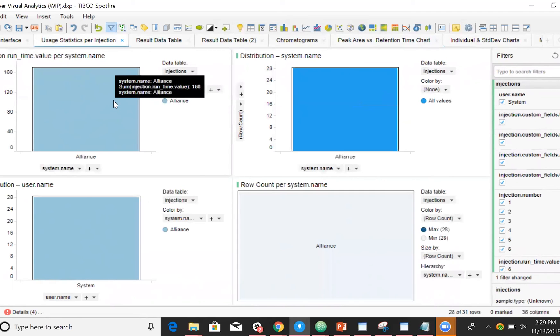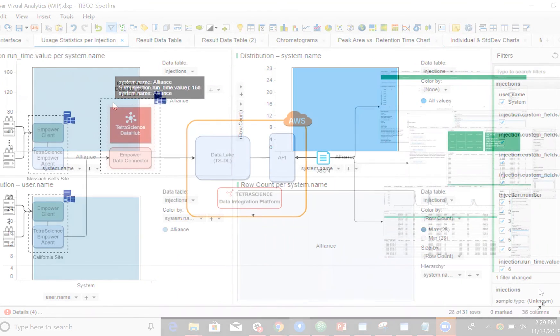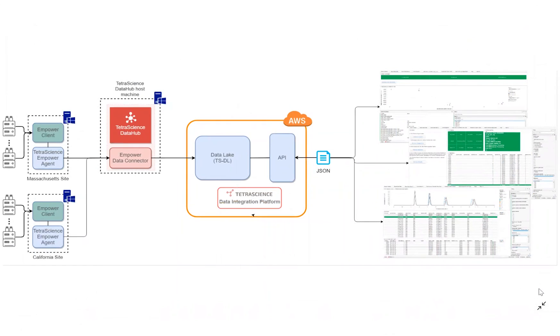Now, as we can see in many of our demo videos, the magic behind this analysis happens in the background. TetraScience delivers a fully automated solution that retrieves, standardizes, and stores Empower data.